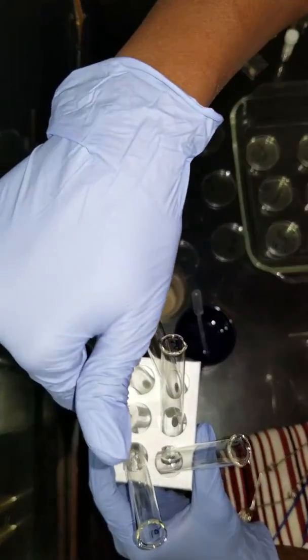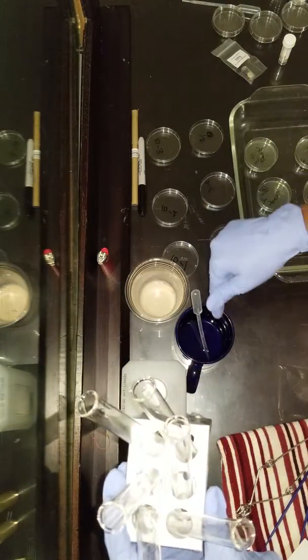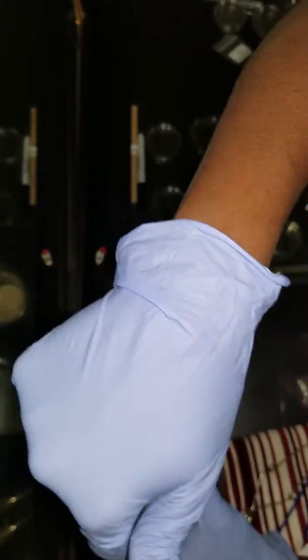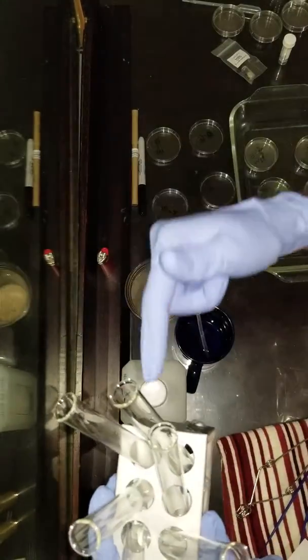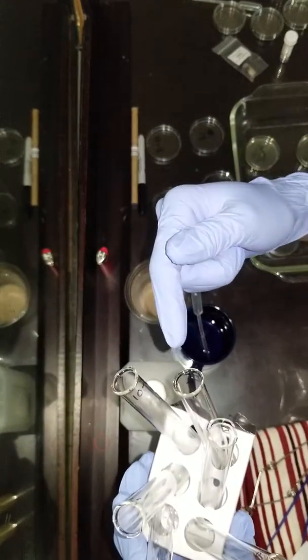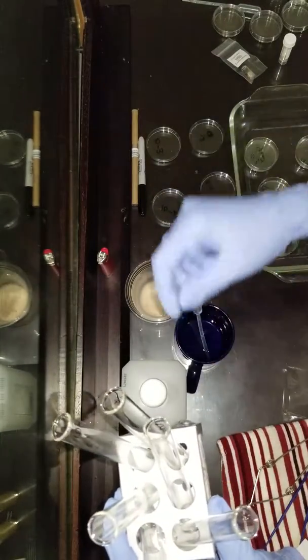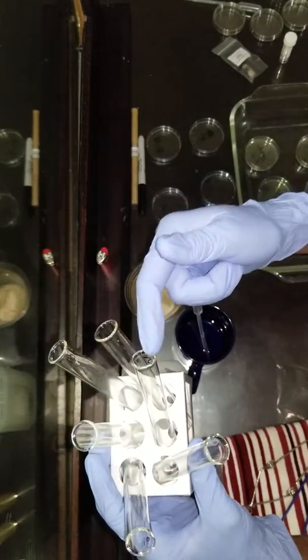Then I pipetted 0.25 again from 10^-2 to 10^-3, transferring. Cleaned the pipette. Pipetted 0.25 milliliters from 3 to 4. Clean. Transfer from 4 to 5. Clean. Transferred again 0.25 of that solution from 5 to 6.